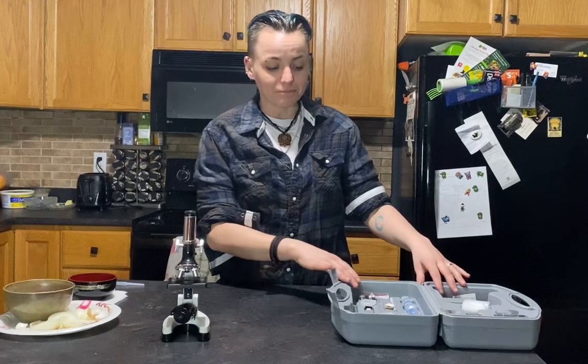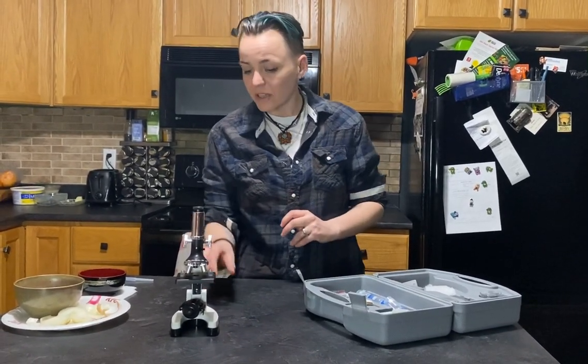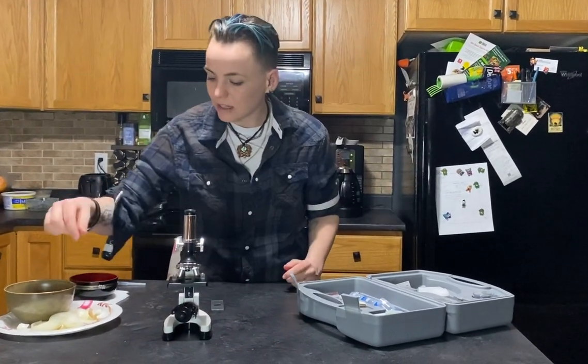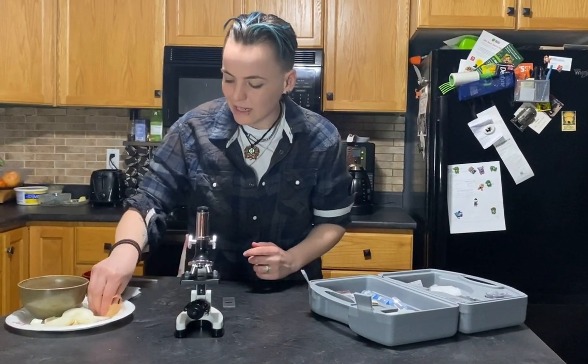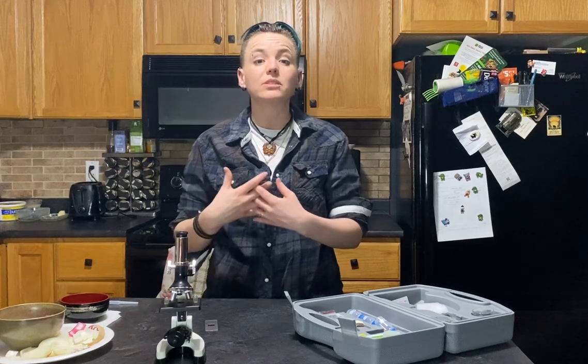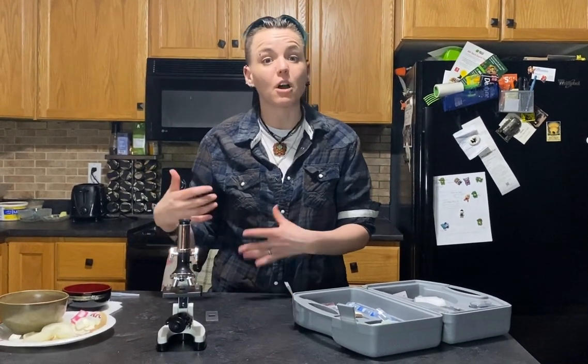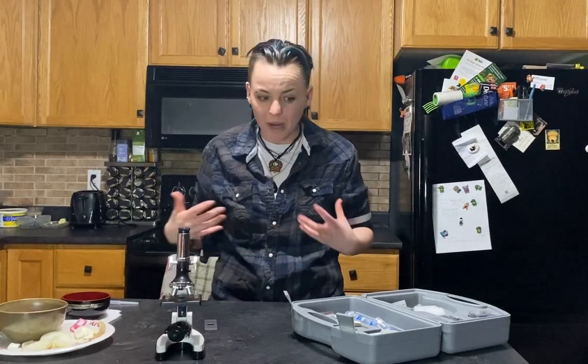In your lab kits and in your microscope kit you are given a bunch of blank slides. This week in your lab kit you were given an onion, so an adult should cut that up for you into pieces that look like these more rectangular chunks. Cut them into slices and then you can put them in a solution of water and food coloring in order to stain all the different parts of the onion. Where we're leading to is we're going to learn about the different parts of plant cells, because from here on in we're going to learn a lot about biology.